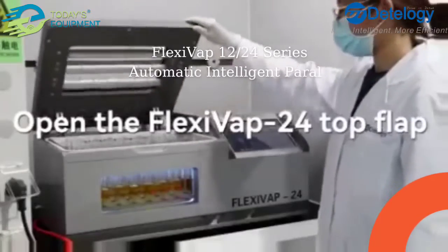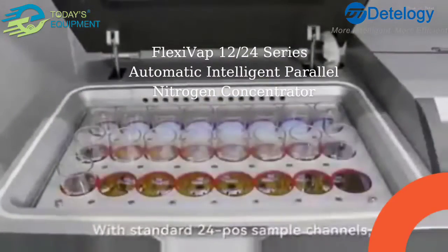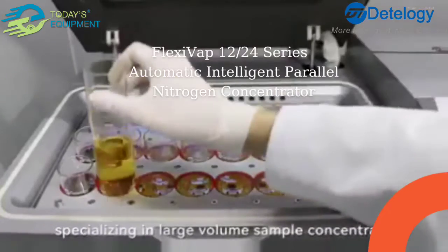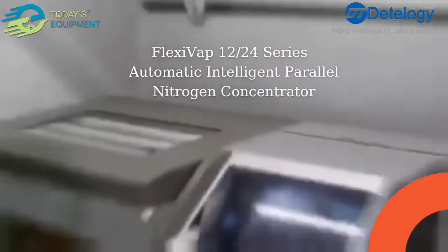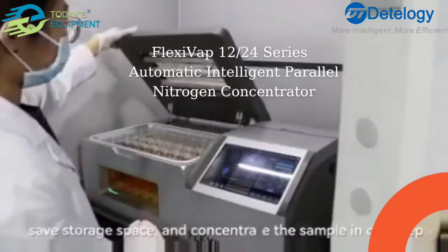Open the FlexEvap 24 Top. With standard 24-channel sample channels, specializing in large-volume sample concentration, it can replace multiple rotary evaporators and save storage space.